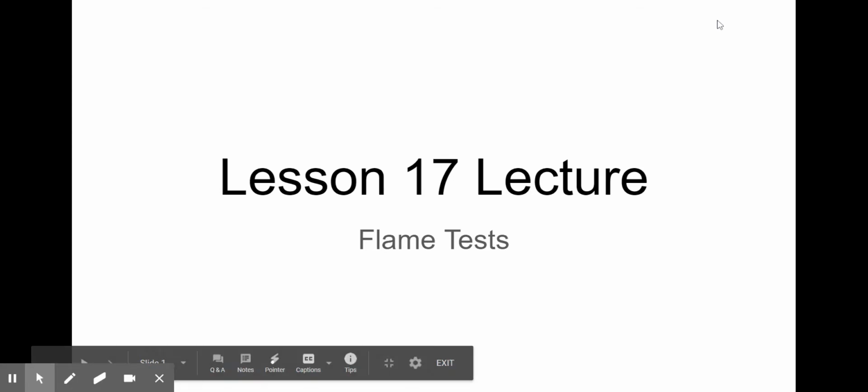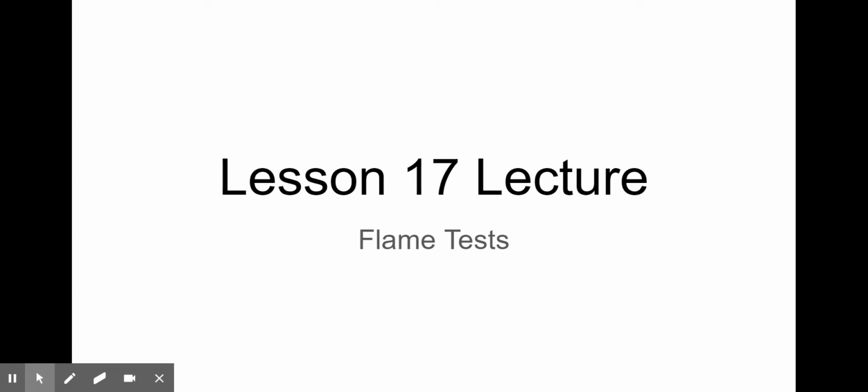Okay, this new section, which is section 4, brings us into studying more of the electrons and how ions are formed. So we're going to start this out with a great lab activity where we complete flame tests. Flame tests are very interactive. You get to see a bunch of different things, but there are some safety concerns that we do have to pay attention to when we do the lab activities for this, okay?